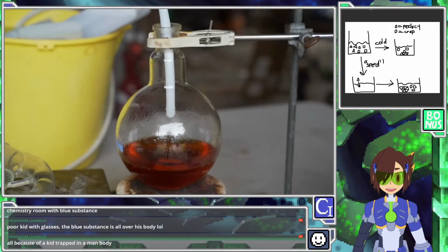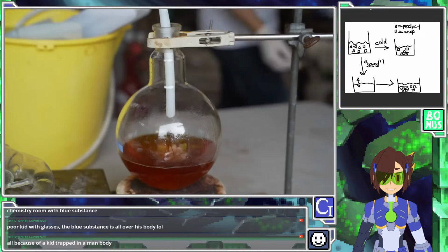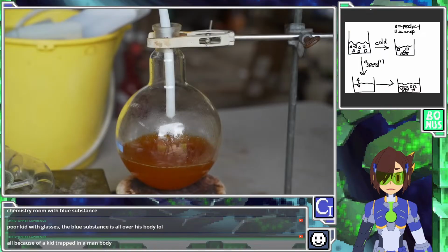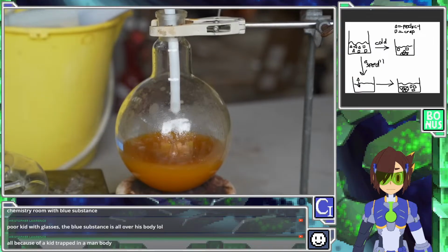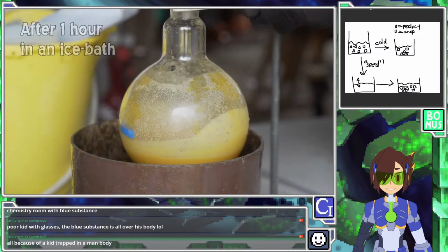I actually had to utilize this in my research at one point because I had a product which only came out of a very, very thick, oily solution after 2 weeks of leaving it alone. I had gone on vacation or something. I can't remember why I left it for 2 weeks. Usually I didn't do that. And then it made the product. It finally came out of solution.